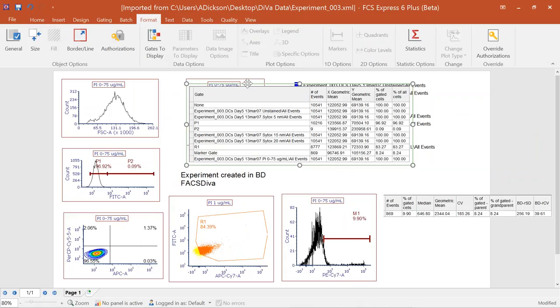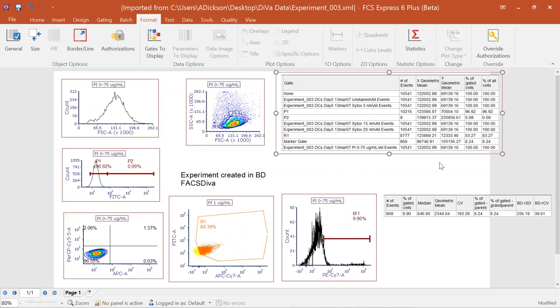Once you've finished formatting your plots and adding statistics, your layout is ready to export as a PDF, Word document, or whatever format you need to share your results. If you're not familiar with batch processing, I strongly encourage you to join that webinar — it'll help you run through data files much more rapidly and get them out in any format type you need.